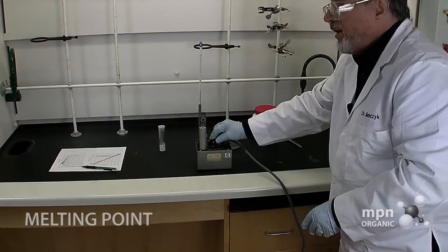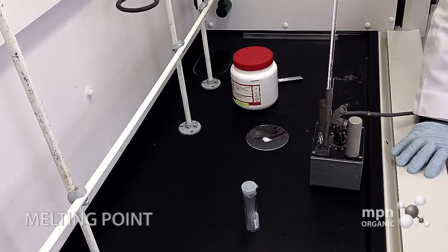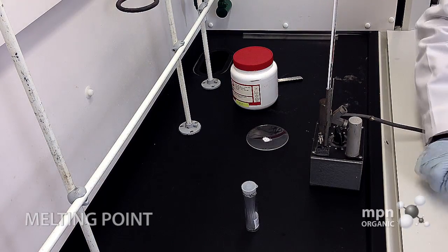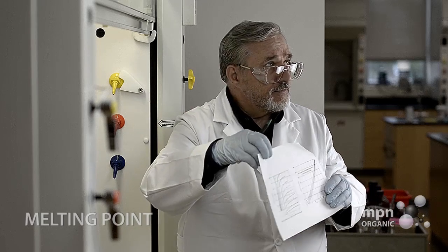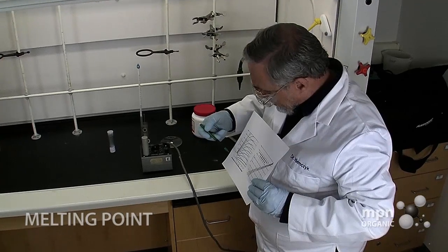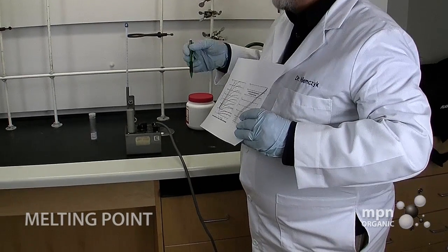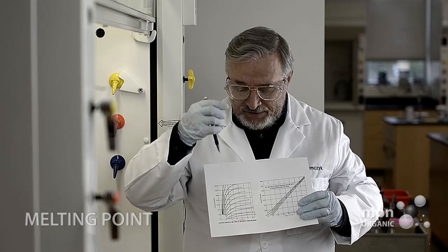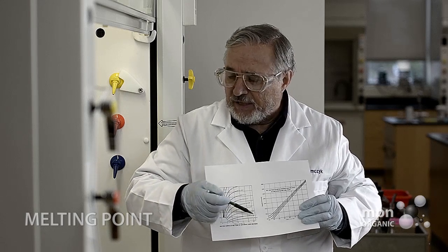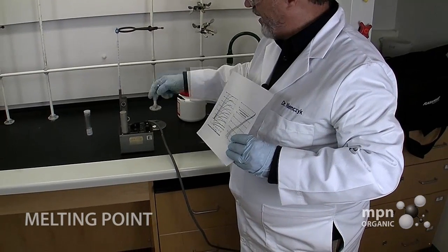Now, how do you know how to set the Variac here? Well, there is a graph that's provided in your online lab manual, which I have a copy here. Okay, and it is time versus temperature. Now actually, what you're most interested in is how high the aluminum block gets with each setting that you have on the Variac.